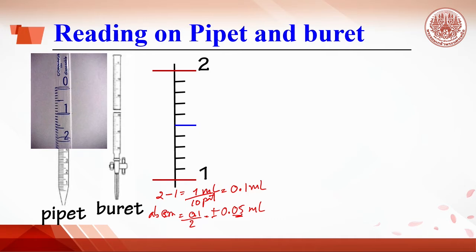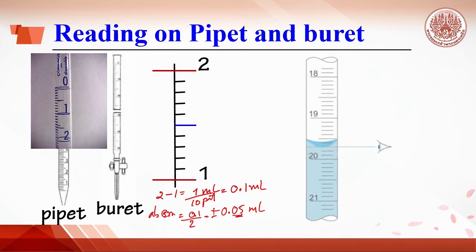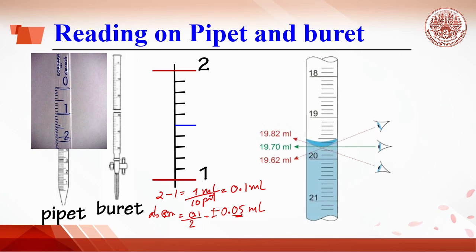It is important to make sure that your eyes are at the same level as the meniscus to obtain an accurate reading. A lower or higher eye level will result in a reading error.